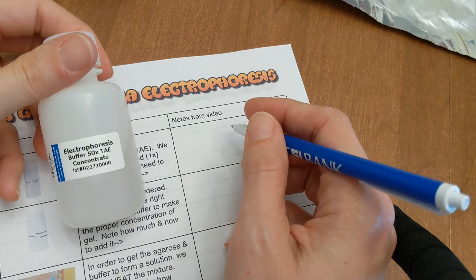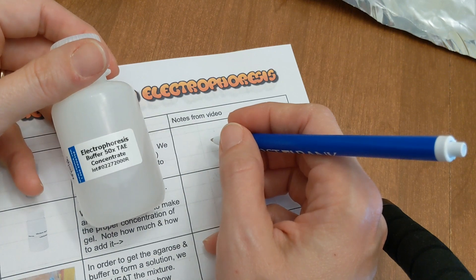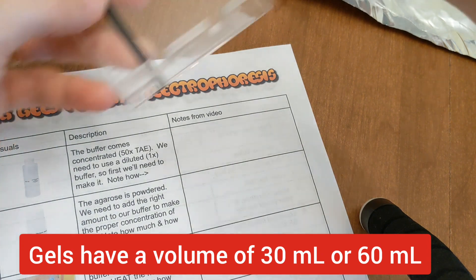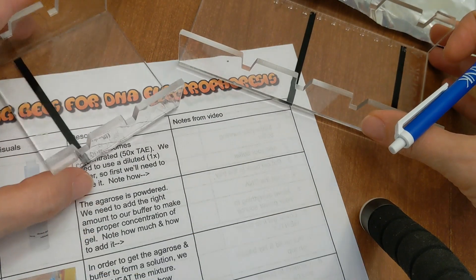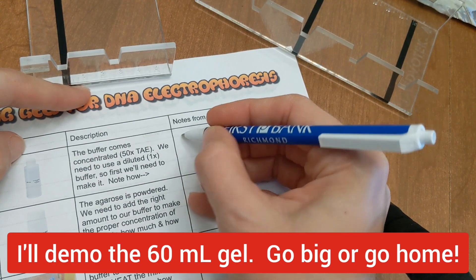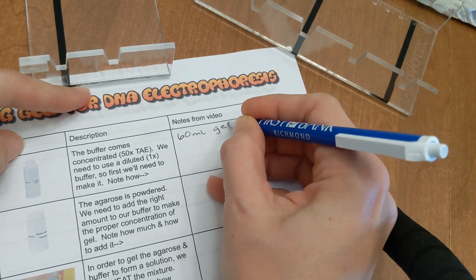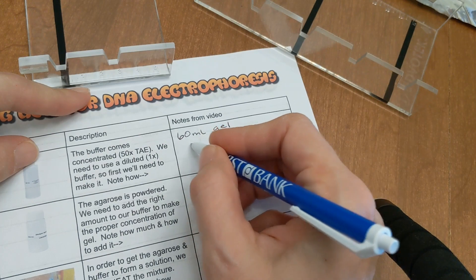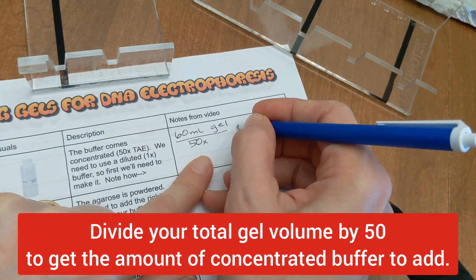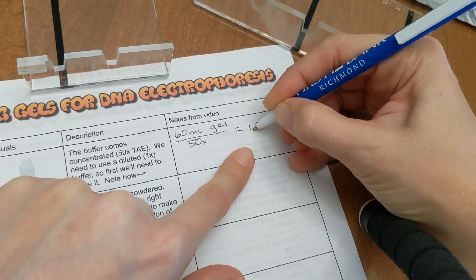Our first step is to dilute our buffer. We have a 50x TAE buffer and we want to dilute this to 1x. We need to think about what volume of gel we're going to make. If you're using the large tray, that's 60 milliliters, and if you're using the small one, that's 30. I'm going to use 60 in my example, so if you're using 30, just cut everything in half. We divide 60 by 50 for our buffer, and that gives you 1.2 milliliters of concentrated buffer to add.